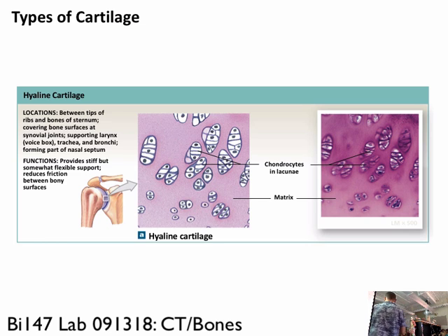You guys got it on your scopes there? So this stuff is fairly stiff, but also flexible, and helps to protect the surface of a joint, okay? The surface of a bone. If you look at it, what you see in this stuff is a lot of empty space, it looks like, or it's shaded, colored space, hard to really make out much in it.